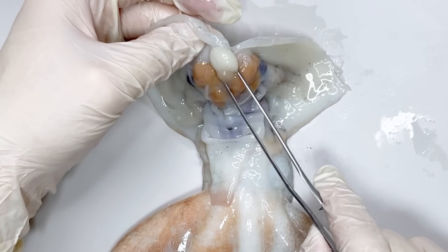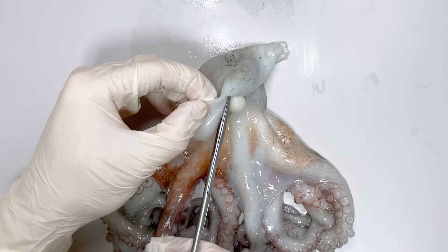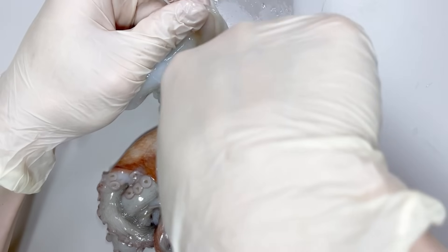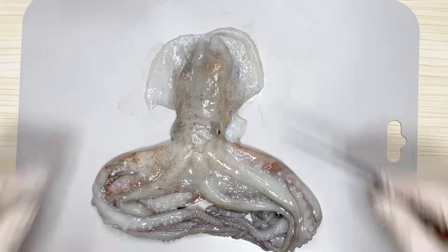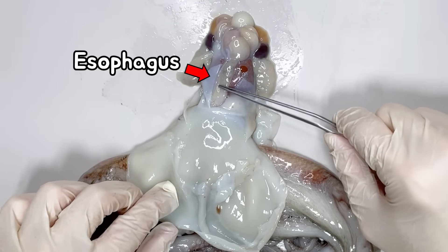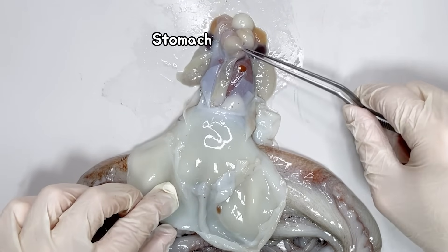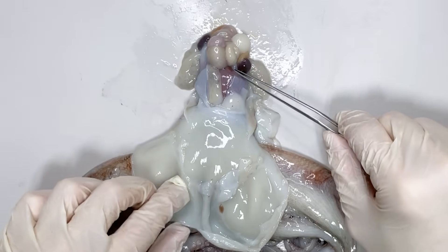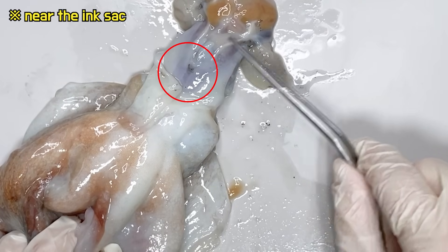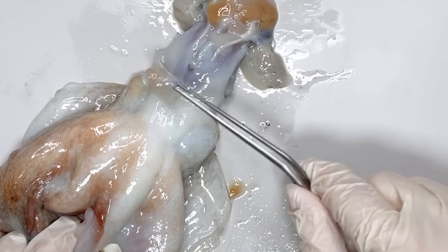The organ located in the upper part here is the gonad of the octopus. Next, to examine the digestive system, we need to remove the membrane at the back, turn it over, and open it up. From the mouth, you can see that the esophagus continues like this. The digestive tract passes through the stomach and cecum above the stomach, then loops back and descends towards the siphon side, where the anus is located. That's why waste is expelled through the siphon as well.